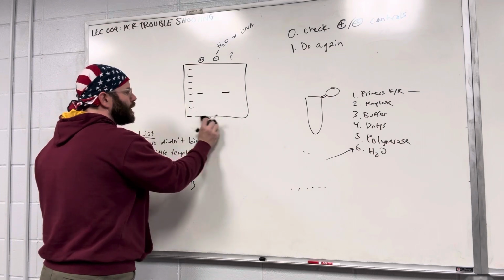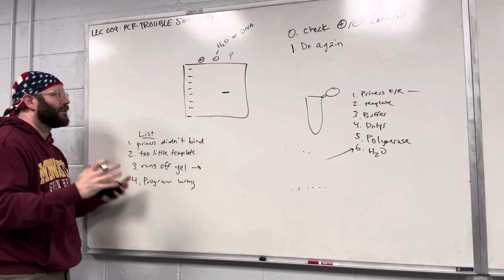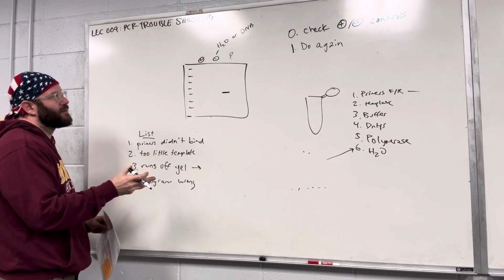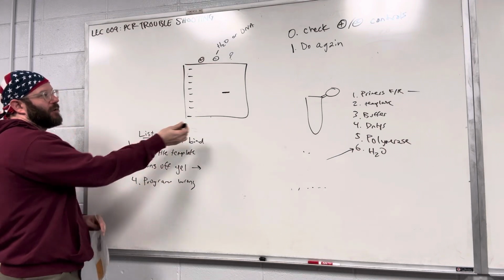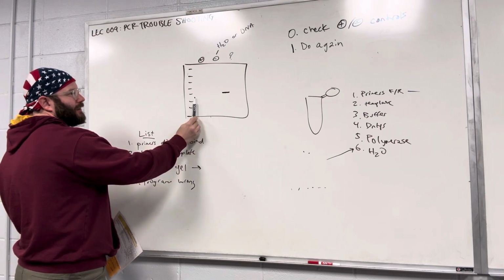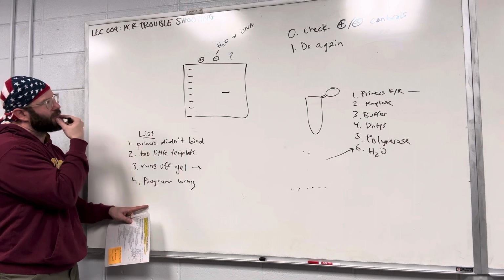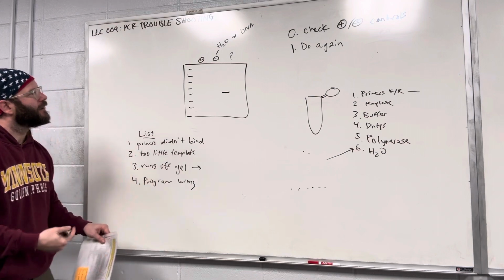Okay. What if you see this result? What would you think? What went wrong here, and what could have possibly been the mistake? So what's the problem with this gel? There's no band on the positive. Yes, so you're missing a band, which should be here, but it's not. It could be a lot of things that make your positive control go bad, so this could initiate a giant list of trying to figure out what's wrong.